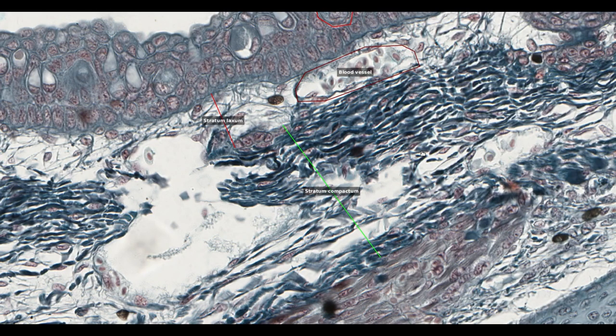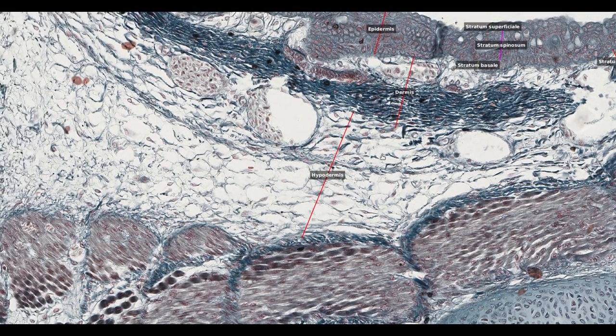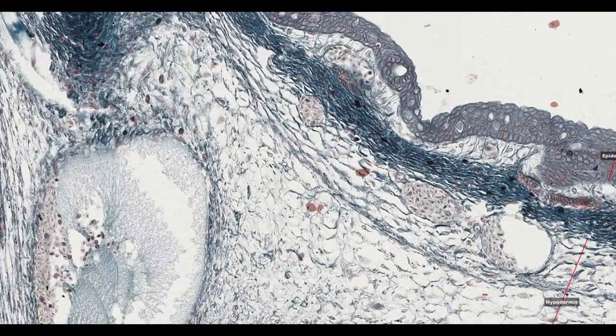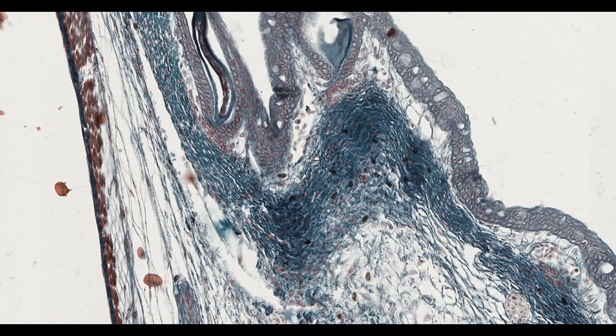Along with these collagen fibers are elastic fibers which will allow the dermis to stretch and not rupture when it's put under forces of rapid swimming. Below the dermis, sometimes there are further blood vessels and loose connective tissue as here where the fin joins the body. In other locations, the stratum compactum directly contacts the underlying muscle.